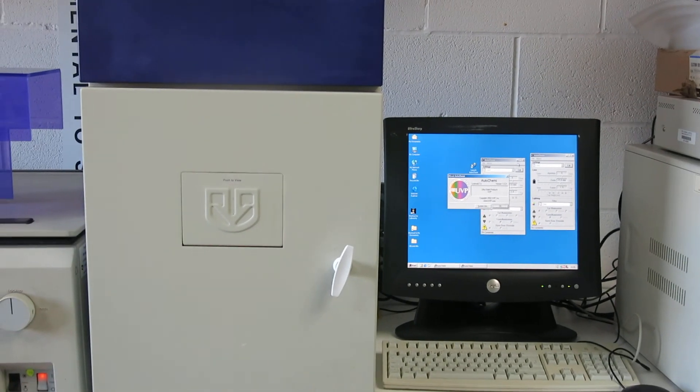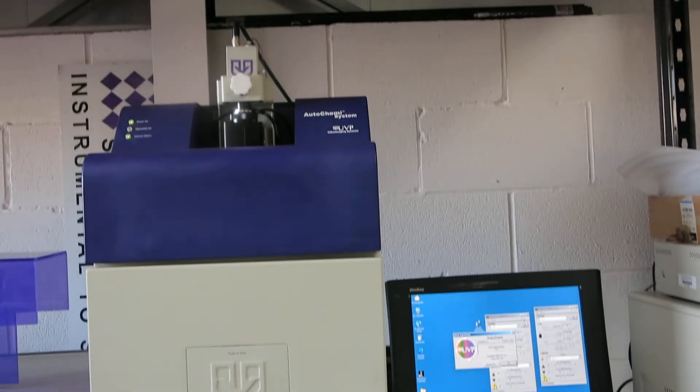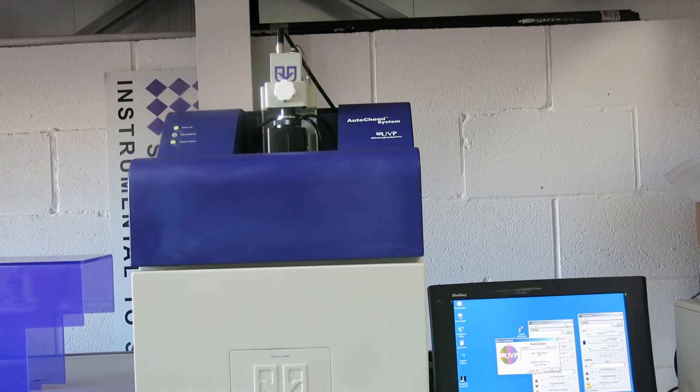This is Nick Edmond, Richmond Scientific, signing off. Hope you've found this to be of use. Just put the top back on.